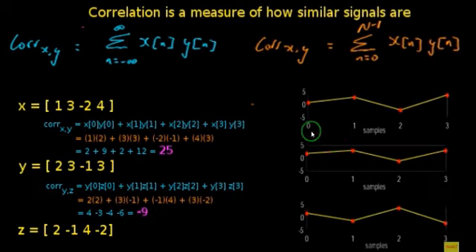Okay, well, first of all, I want to go for the correlation, and then we will introduce the autocorrelation, and after that we will go for the use of autocorrelation for the patterns that our detector got, to analyze them and extract the information about the size. So let's now start with the correlation.